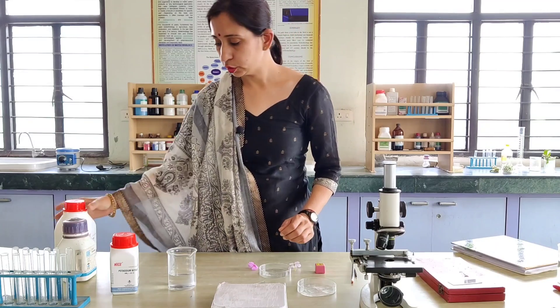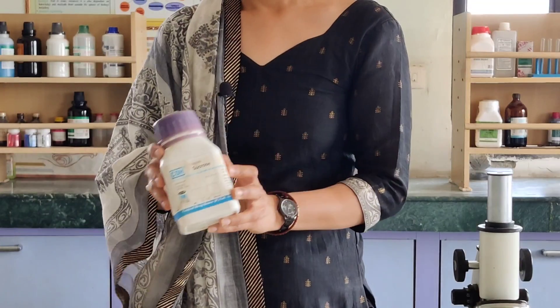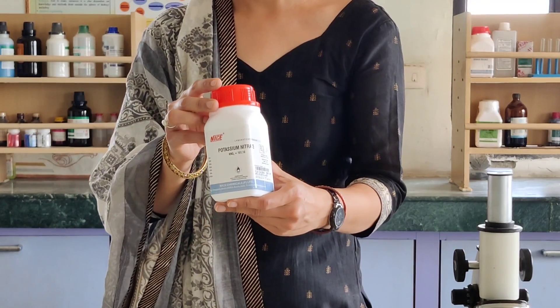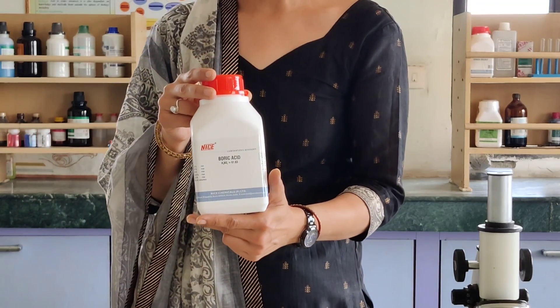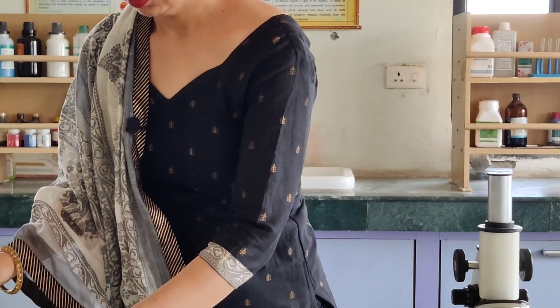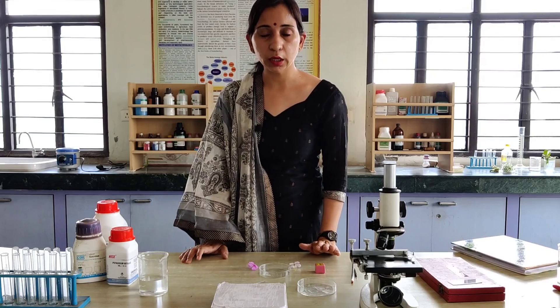First of all we require sucrose — this is the sucrose. Next we require potassium nitrate, then boric acid, and distilled water. For this experiment we need to prepare a nutrient solution, a nutrient media.